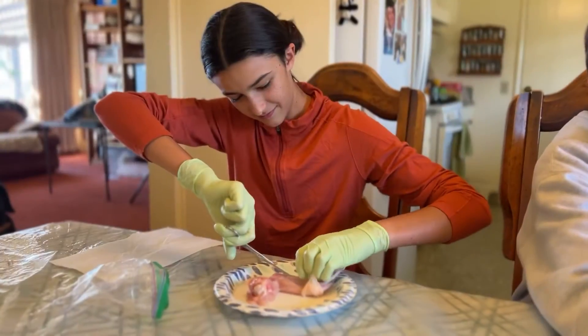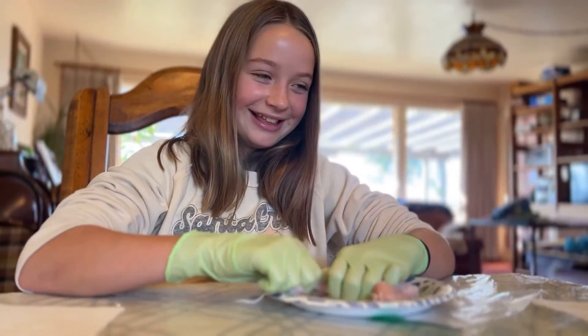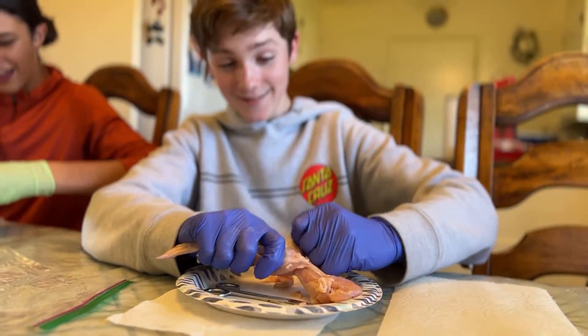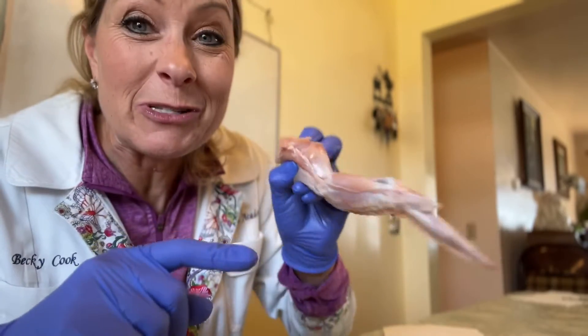These kids right now are actually taking the skin off of this wing so that we can see the muscles and the bones that are underneath it. Check this out. These students are still trying to take the skin off of their wings, but I want to show you something really cool.